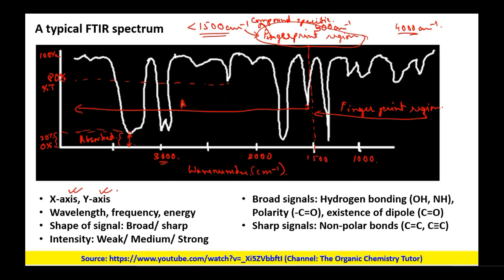Why is it called the diagnostic region or the functional group region? As the name suggests, most of the peaks associated with a particular functional group will be present in this region.